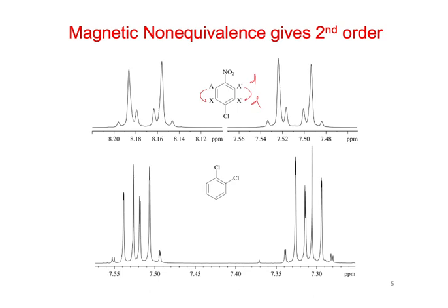Because it only has one main proton next to it. But because we have this situation where A couples to X, and A can have a different coupling to X prime, so we could have J AX does not equal J AX prime, then we end up with these second order effects, which are these small peaks down here.